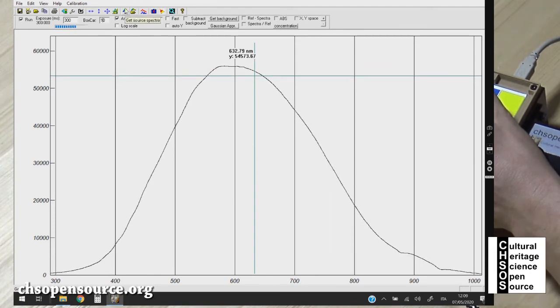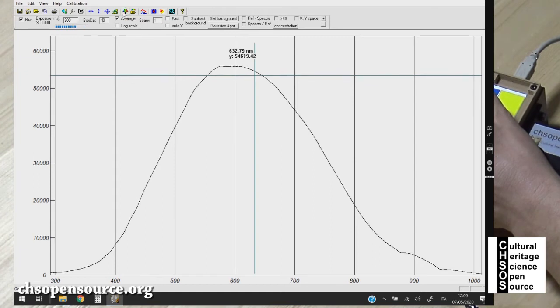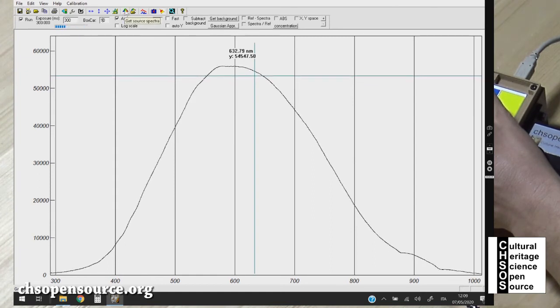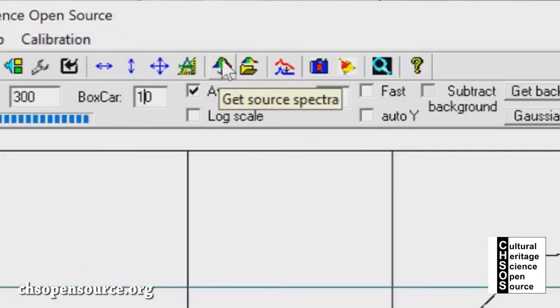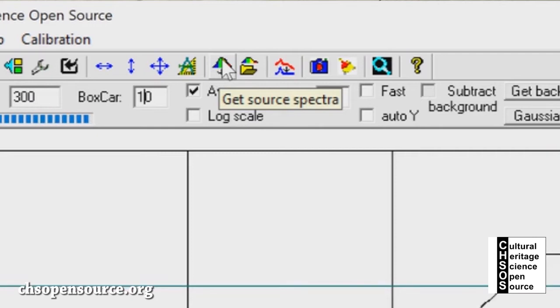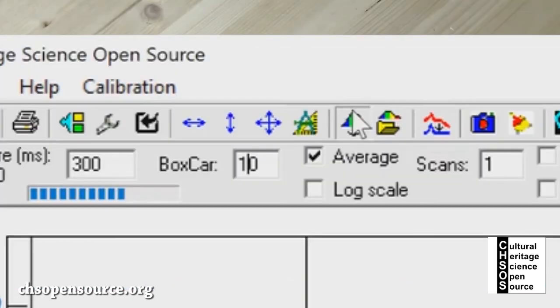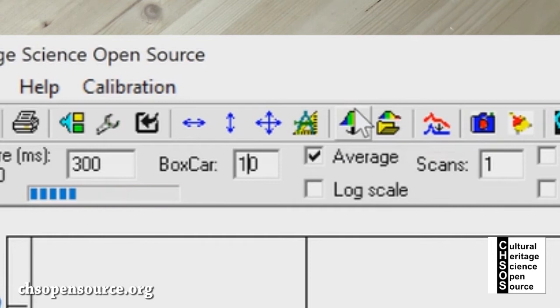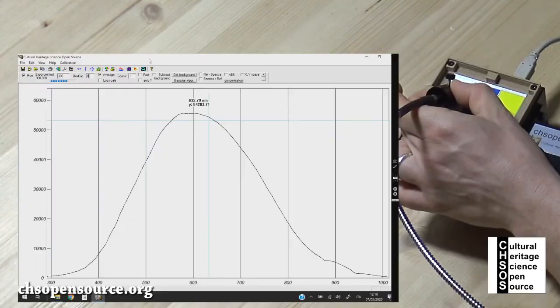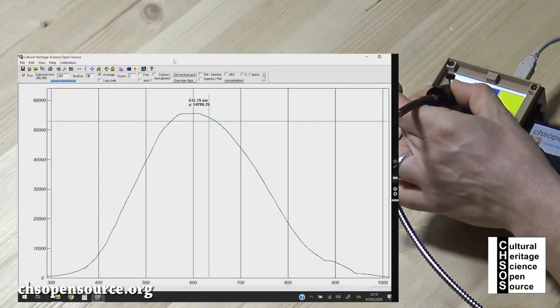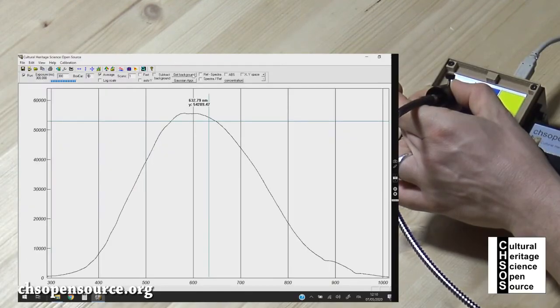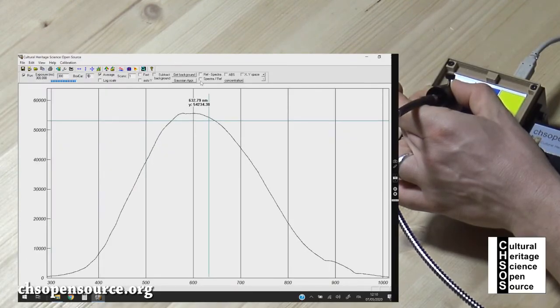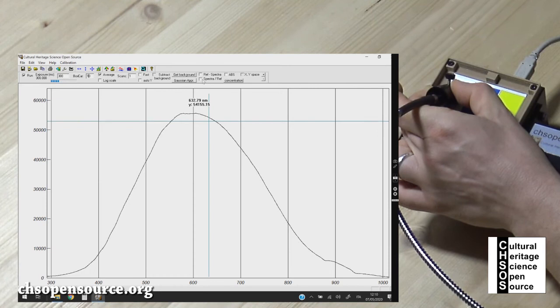Then what we want to do before we start is we go in boxcar and instead of zero we put 10. This creates this kind of average, a smooth expansion. For reflective spectroscopy this is pretty nice. We can use this value of 10.